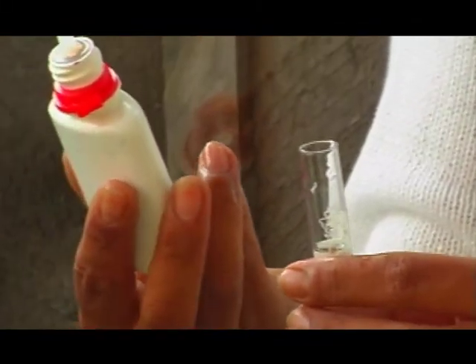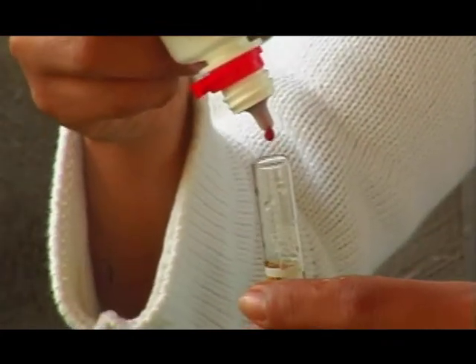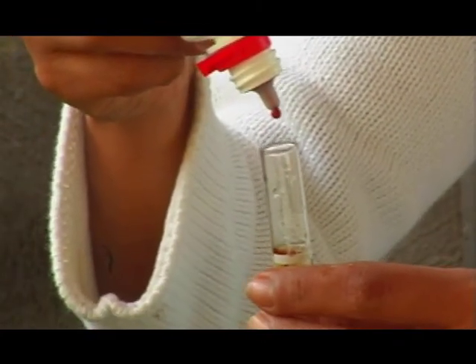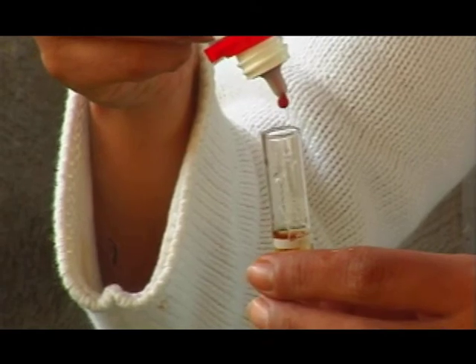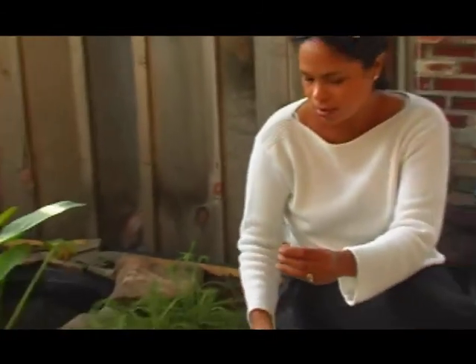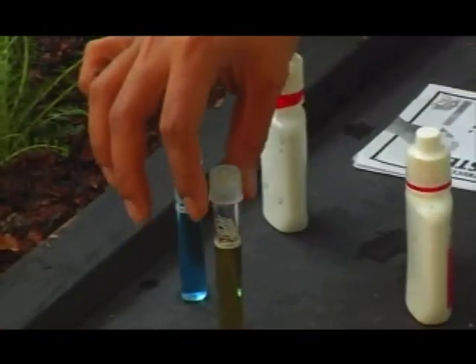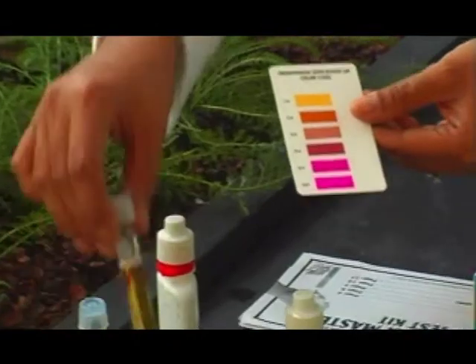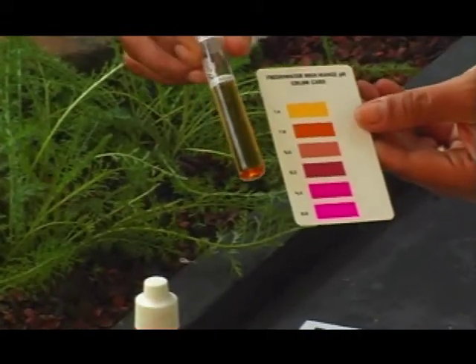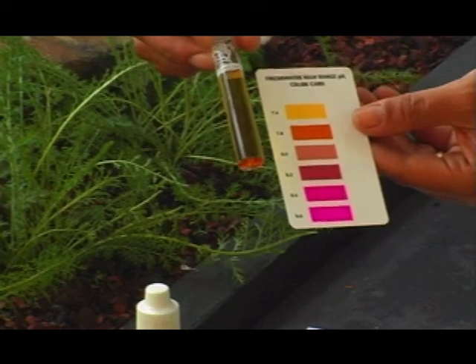There we go. This one I'm going to put five drops — one, two, three, four, five. Now I'm going to take my little color card here and put these two together. I think that is reading between a 7.4 and a 7.8 roughly.